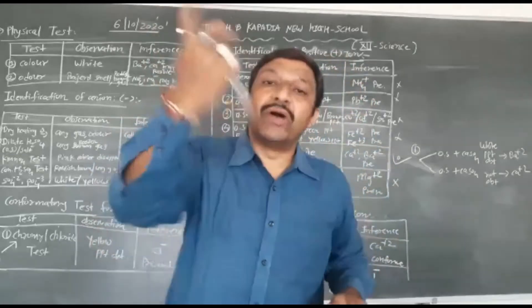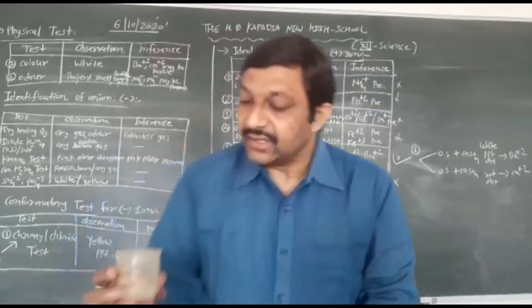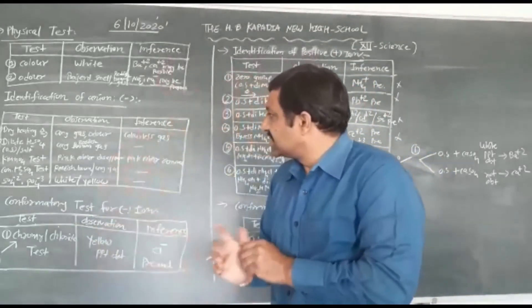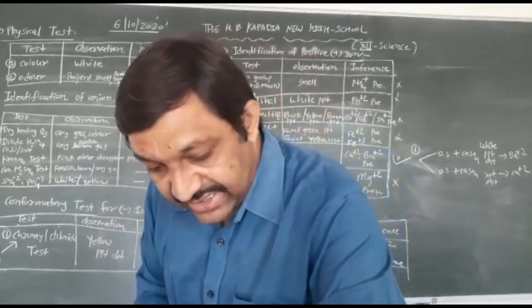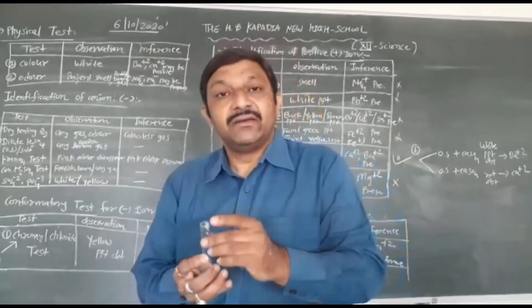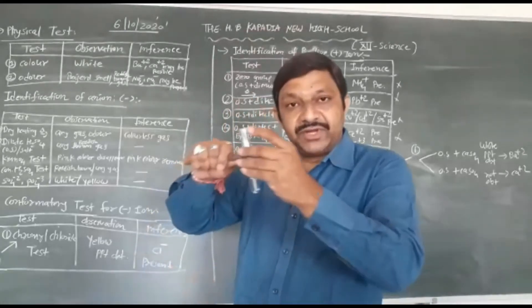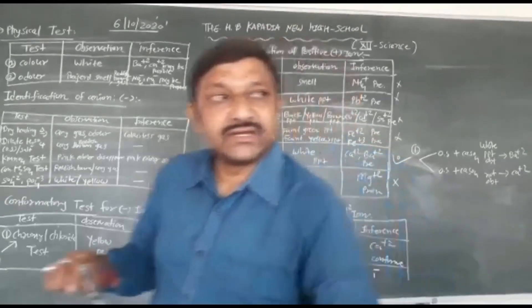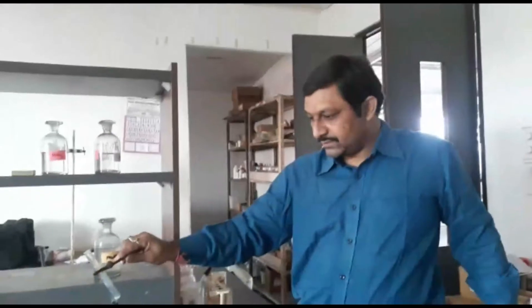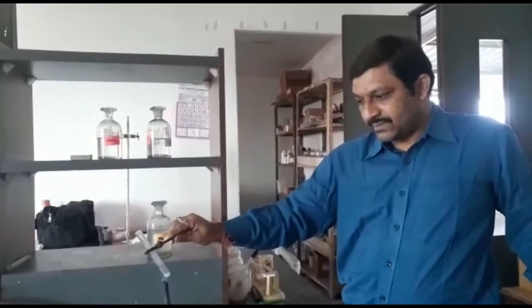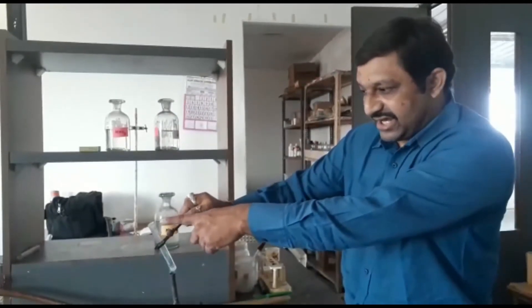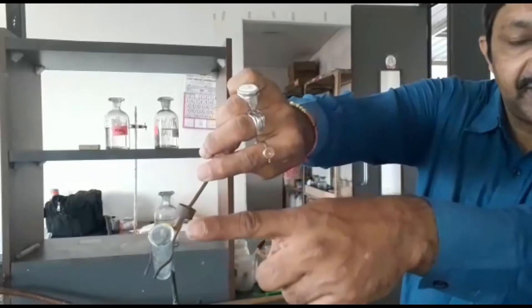Here is your original solution, and here is the calcium chloride in powder form. In the dry heating test, you will see white gas obtained. We will take some salt and heat the test tube. Look here — white gas is obtained. You can see the white gas here in the dry heating test.